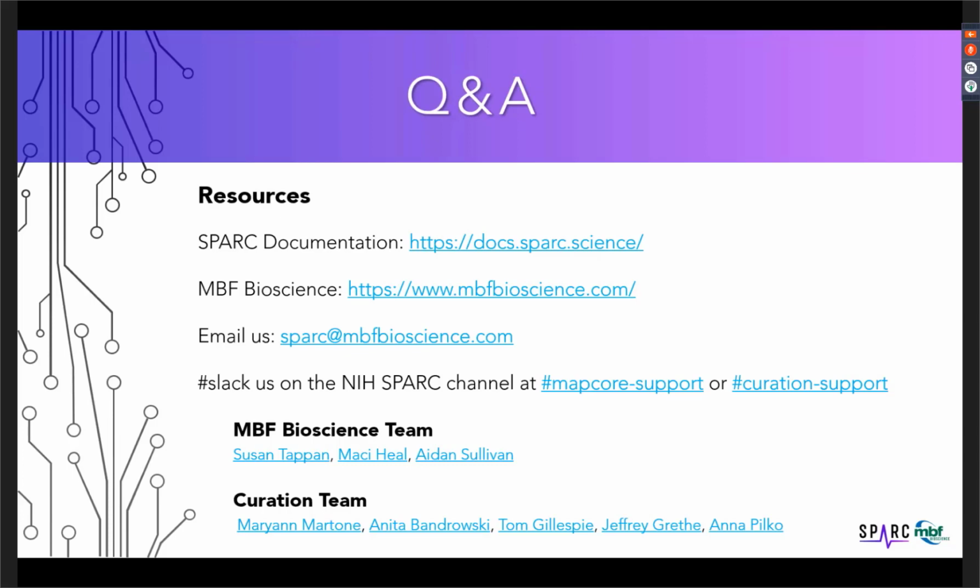If you have image data of any type that goes along with other experimental paradigms that you're after, we can help ensure that your data is captured and represented on the portal in as many ways as possible to make it a really rich experience for other people, including yourself and other colleagues and other interested researchers to explore the data sets once they're made public.